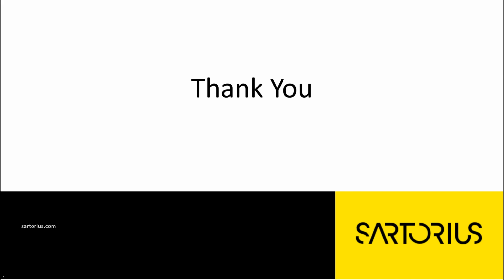I guess the aim of the question is, can I get something like a statement or a certificate that the balance is CFR compliant? And the answer is no, because the IT also has to take some measures to support the CFR compliance. For the balance alone, no.